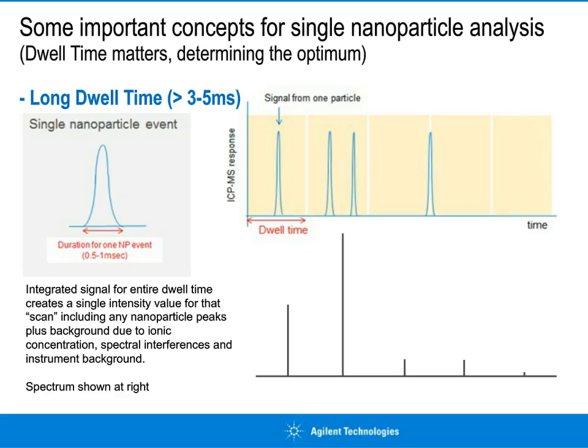It's also possible for a particle to randomly elute between 2 scans, or partially in one and partially in the next. And if there's some settling time between scans where no information is acquired, then some of that intensity would be lost. And so you can see, looking at the mass spectrum below, there's a very small peak representative of scan 3 and a small peak representative of scan 4, which represent the tails of that peak. And a large part of that peak was lost in the settling time between those 2 scans.